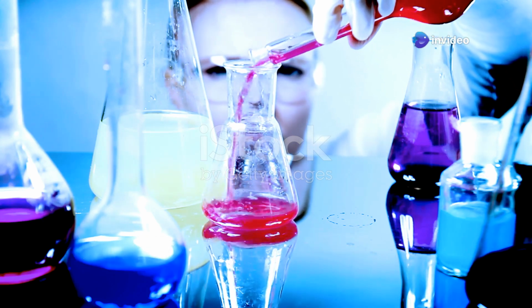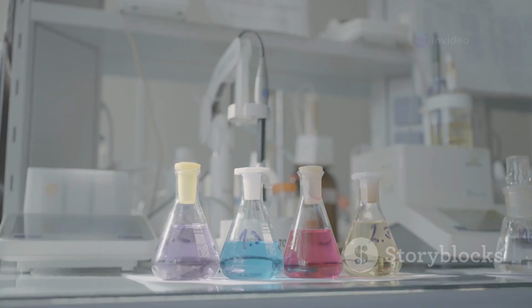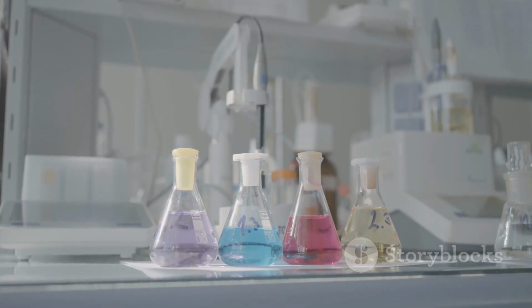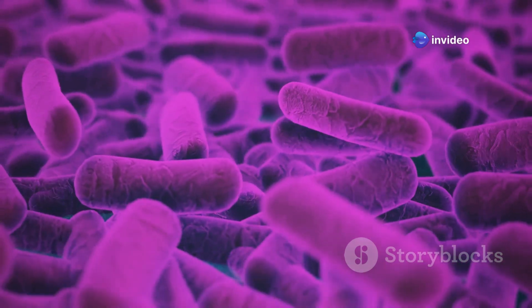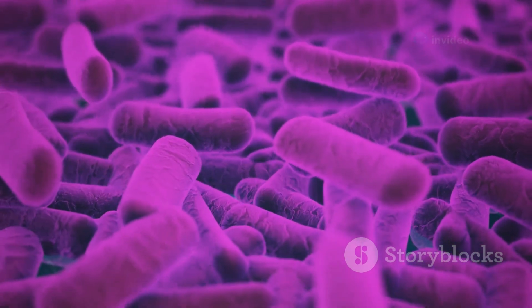Every good magic trick needs its secret ingredients, and gram staining is no different. We have 4 key reagents, each with a specific role to play in this microscopic color show. First up, we have crystal violet, our primary stain. This purple dye is like the initial flood of color, staining all bacteria with a vibrant violet hue. Think of it as the base coat of paint.